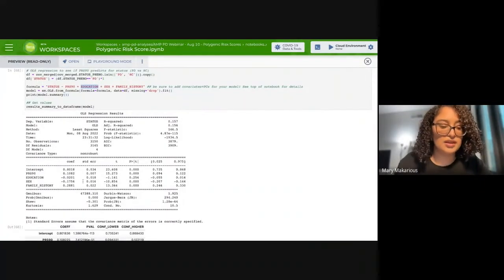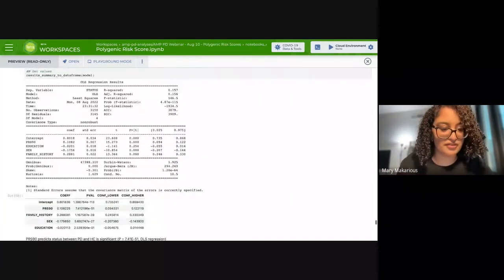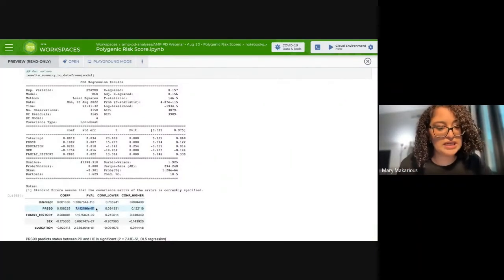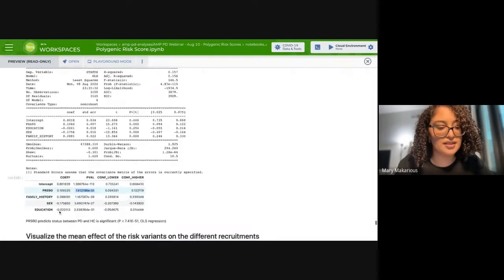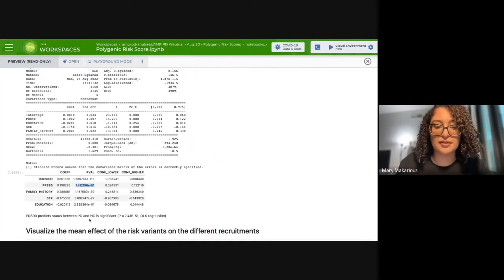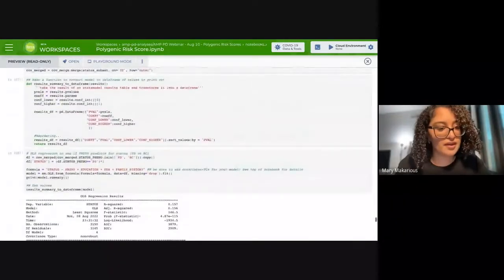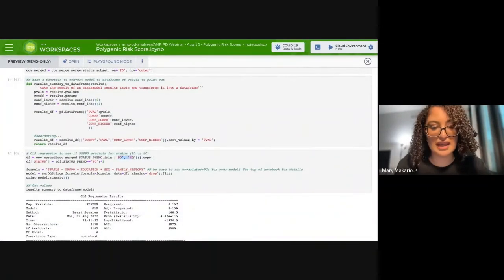These are the results that you get. This is an abbreviation of the p-values, the confidence intervals, both lower and higher, 95% confidence intervals, and the coefficient. And you can see here that the p-value of PRS 90 shows PRS predicts the status between Parkinson's disease and healthy controls, and it's quite significant as well. So you can modify this to your liking. You can really subset this to any enrollment arms that you want. You can play around between PRS 90 and PRS 83 after excluding rare variants.